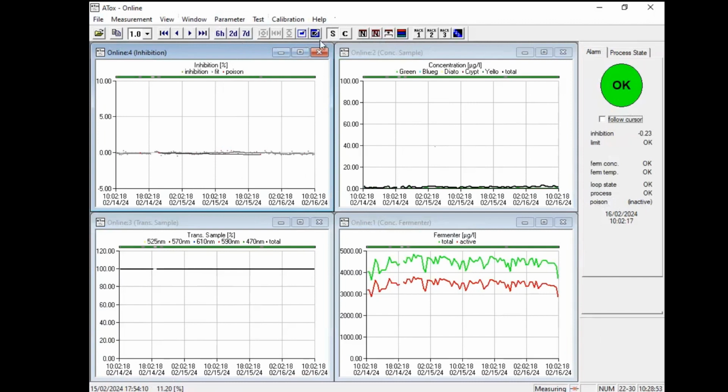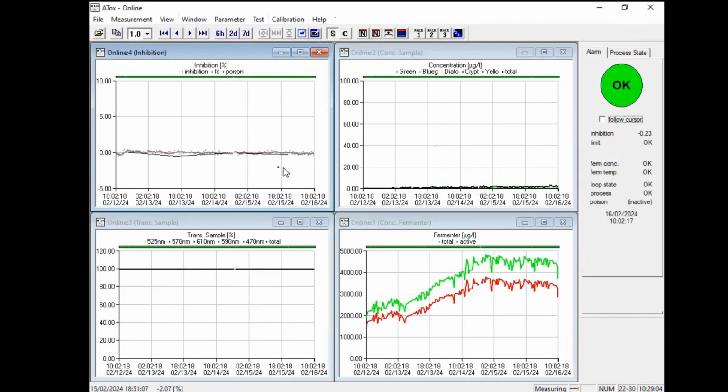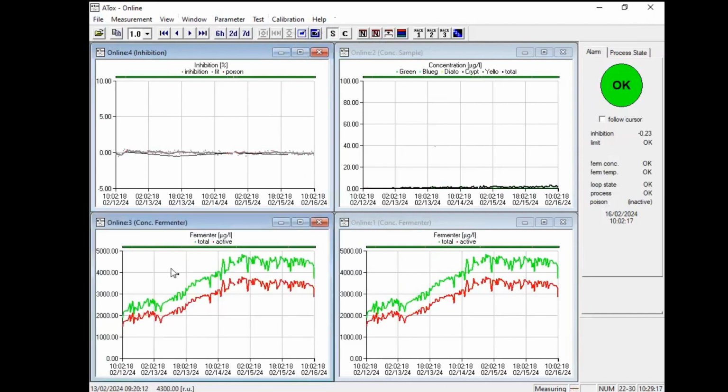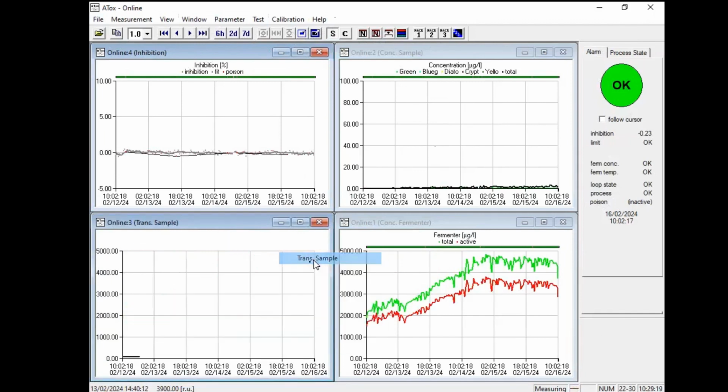This can also be altered to zoom out or zoom in. I zoom out, and you see, oh, it's a little bit longer time. It's increasing by 25% of the time, and the other decreases it. And zoom in is also possible if you want to see more details of the data. If I say, oh, this is 100% transmission, I go back to transmission sample.